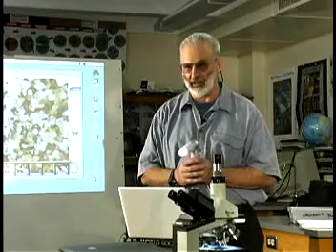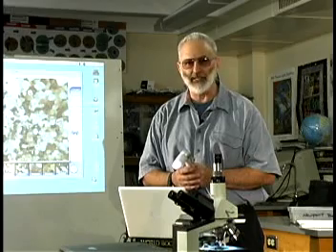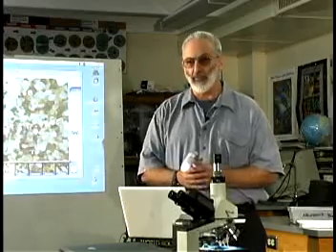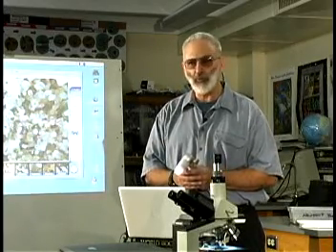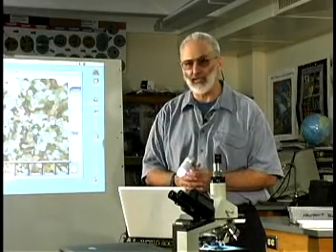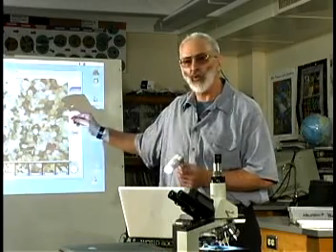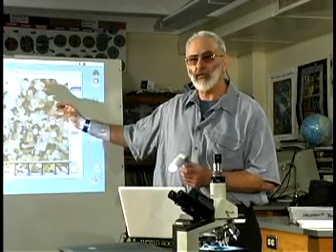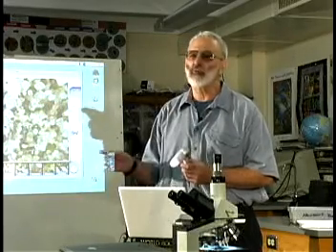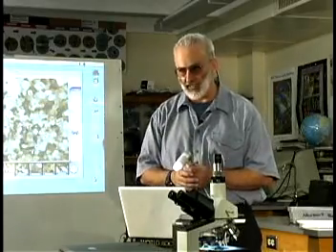When you get through sorting, what that will automatically do is give you percentages, since we're based on 100. So if you have 37 white clear grains, 37% of your sample is quartz. If you have 7 dark black grains, then you have 7% of your sample being basaltic. As you take samples up and down the coastlines of California, through Oregon, through Washington, you can literally see those percentages change as you go from more of a granitic type beach to more of a basaltic type beach.